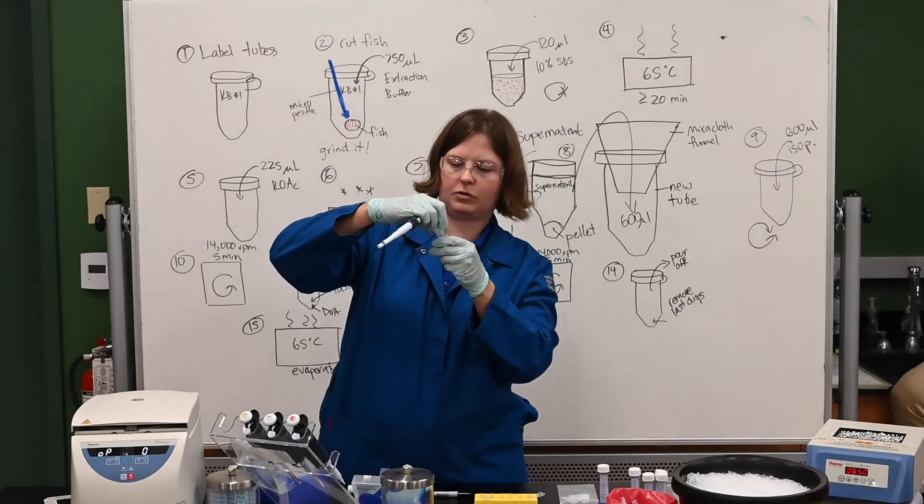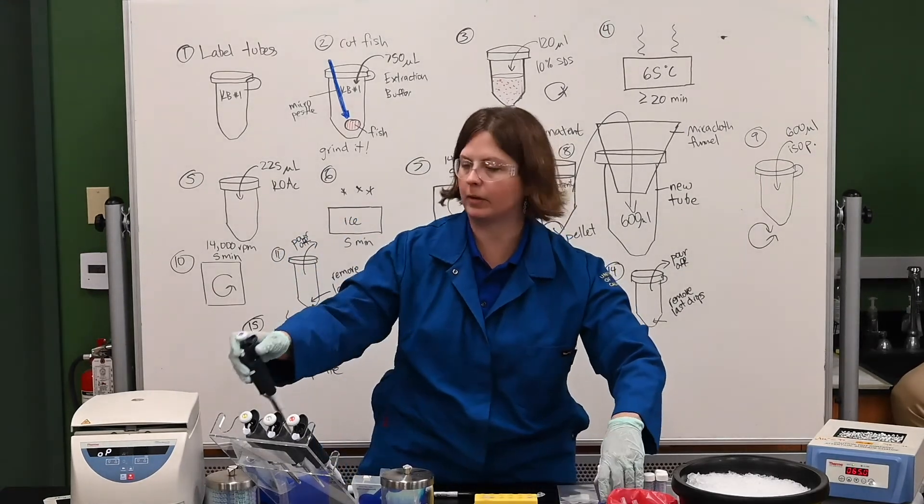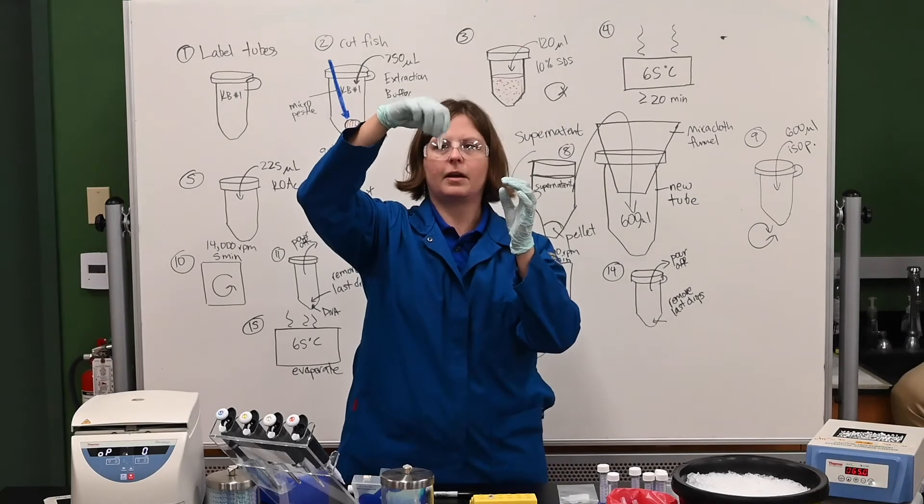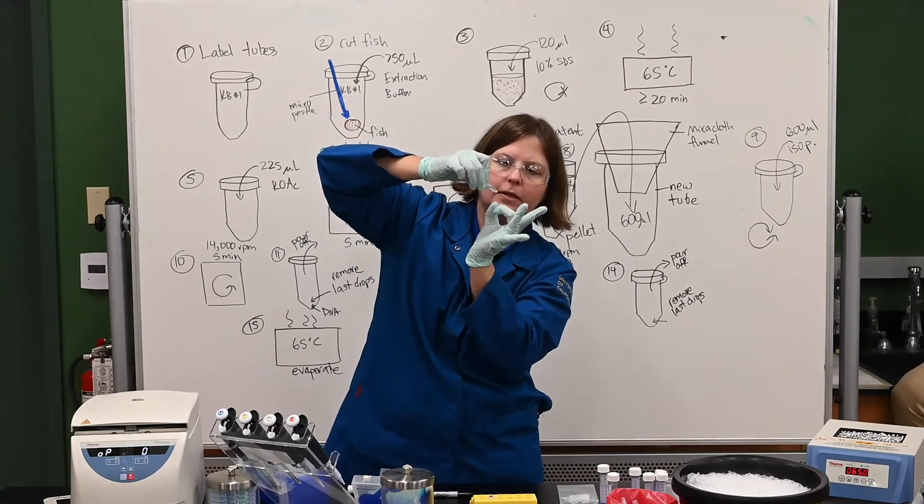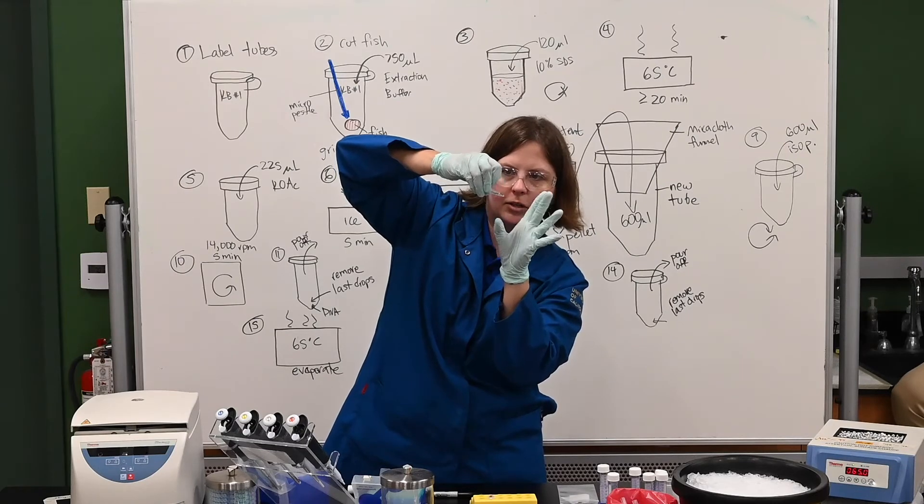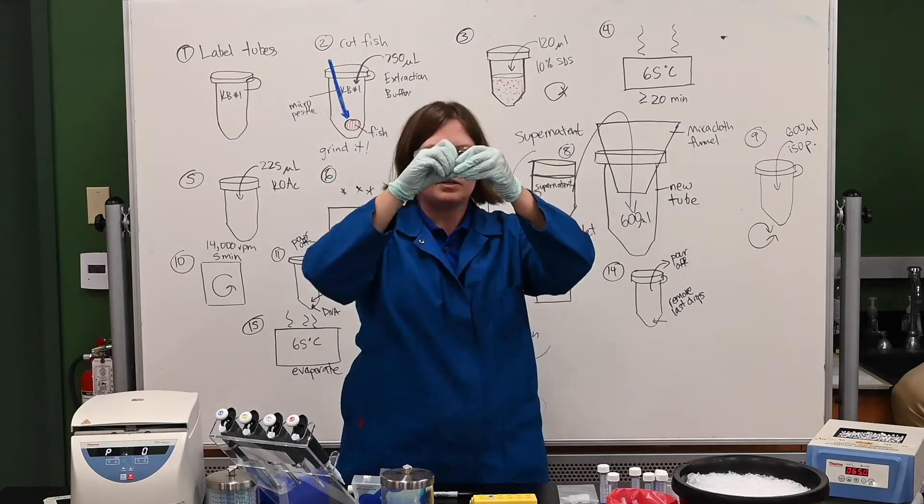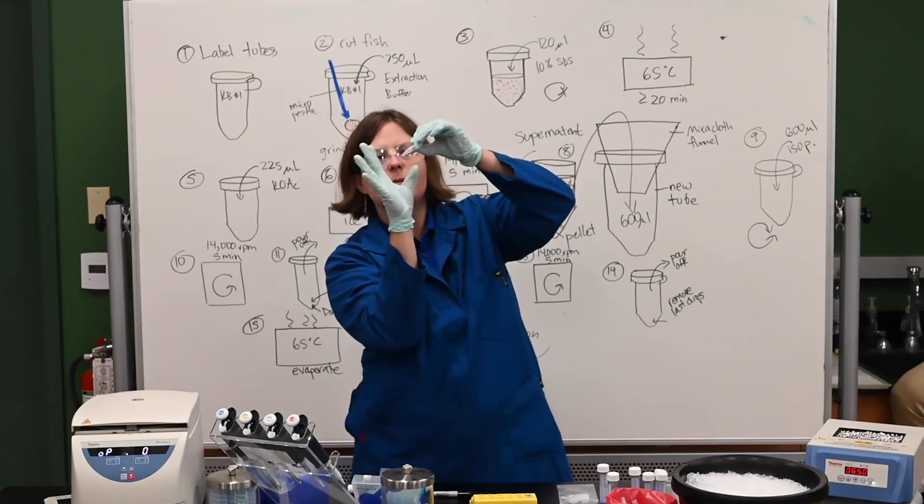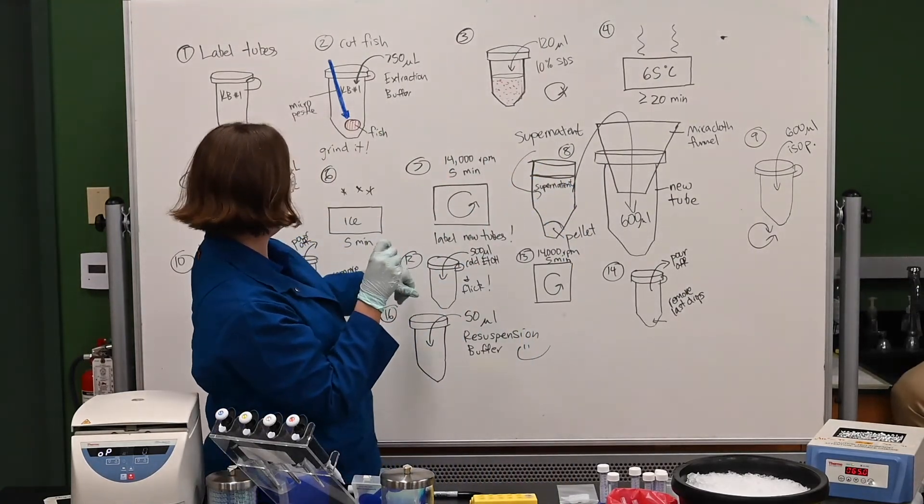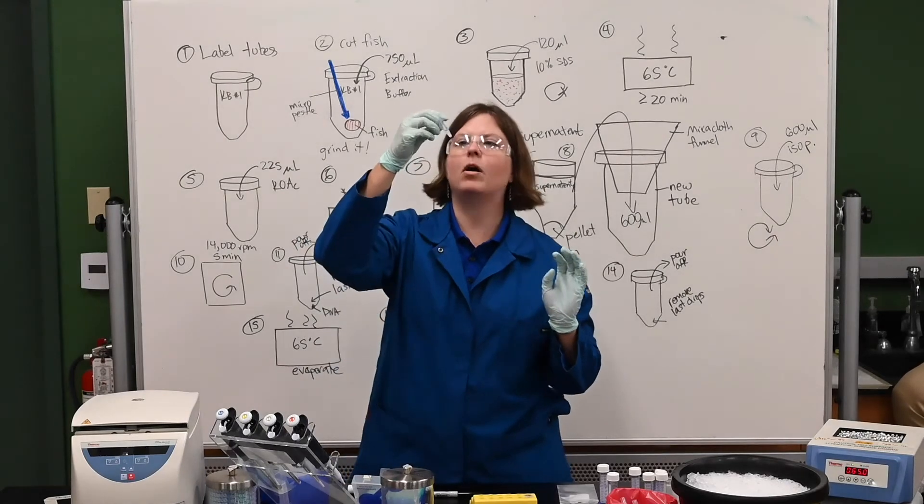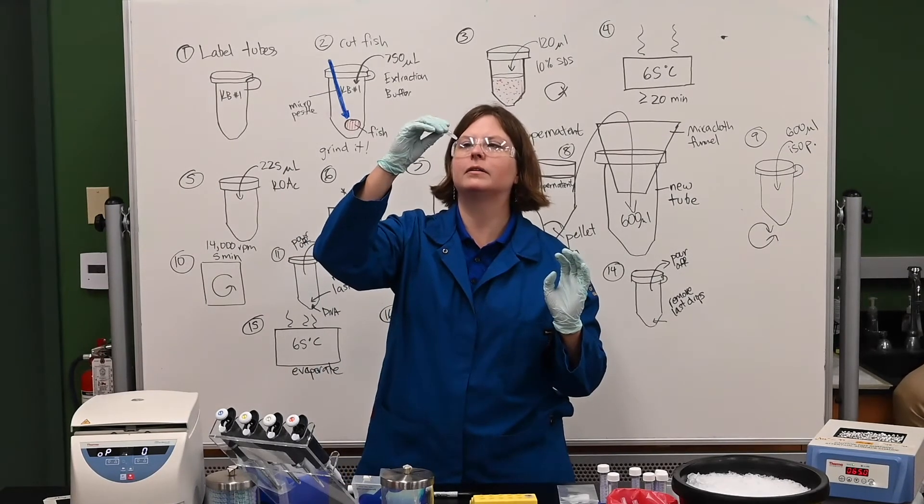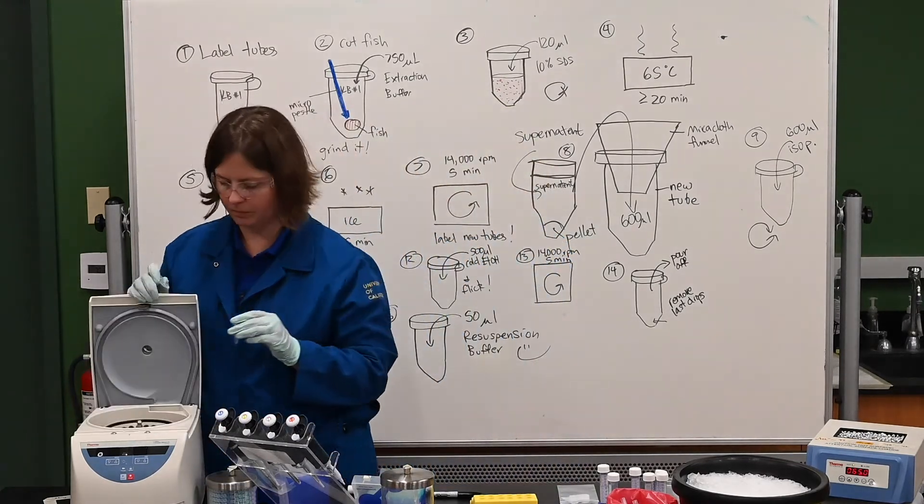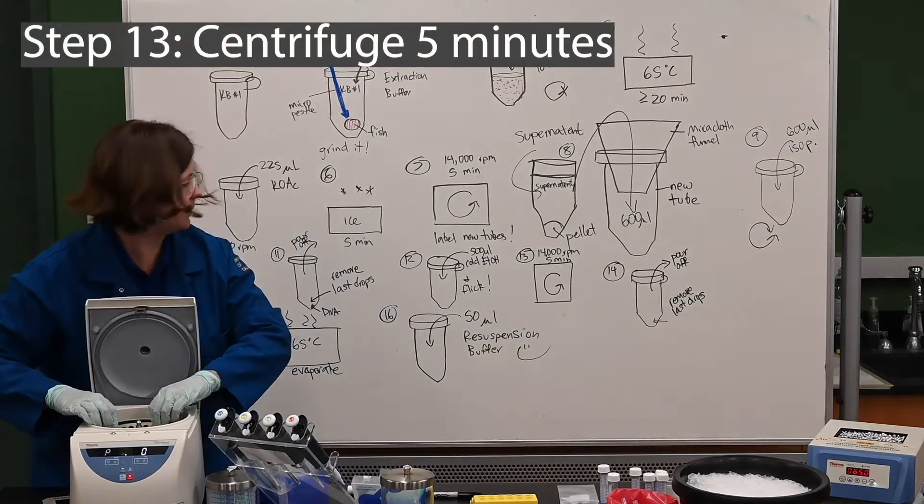I'm supposed to flick it to try to dislodge the pellet, which I can't see, but we're going to try. So this part's kind of fun. It's in there. I'm going to flick it like you're flicking your sibling's ear, right? Like you really want to smack and get their attention. That's pretty well smacked. The other one. Smack, smack, smack, smack. It's been smacked. Spin it again, because I'm hoping I dislodged that little pellet from the bottom and that it's being bathed with the ethanol. Make it stick to my tube again. I'm going to spin it again.